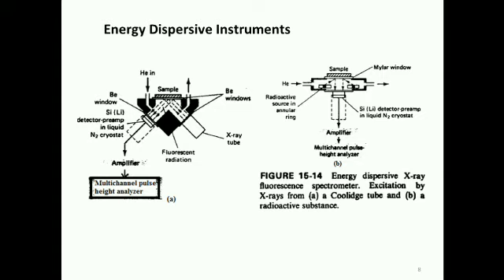It may be called a tube or radioactive material, and a sample holder. This is the sample holder, and a lithium drifted silicon detector and various electronic components to differentiate in the energy.